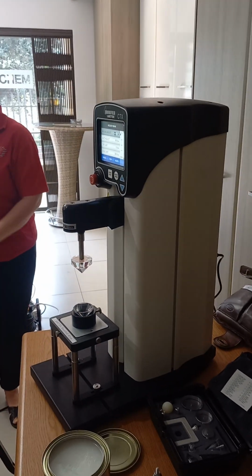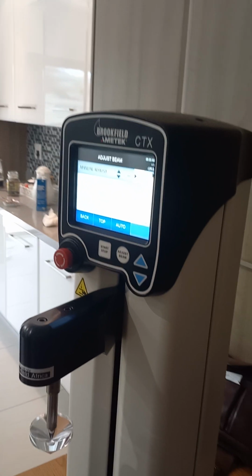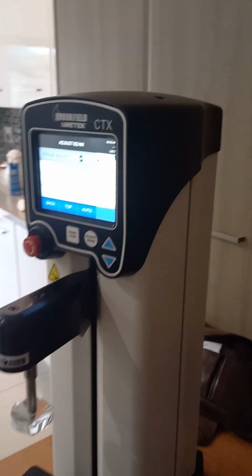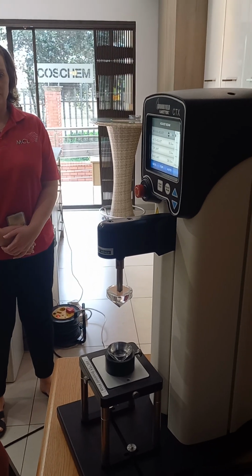What this is essentially is a measurement of a force that is being applied to your sample. Wherever there is some kind of subjective measurement that needs to take place, this will quantify it.